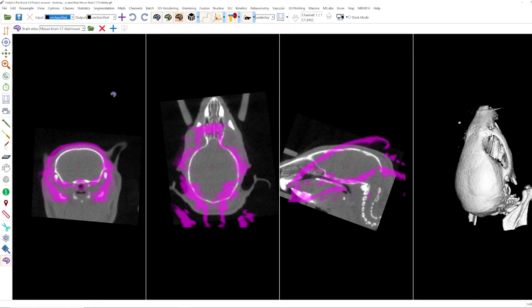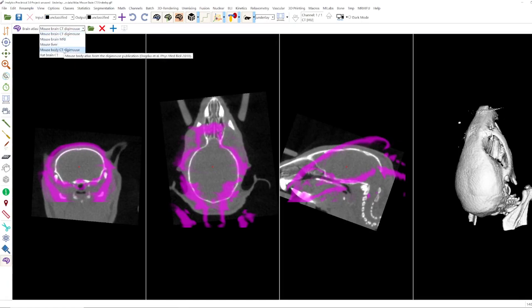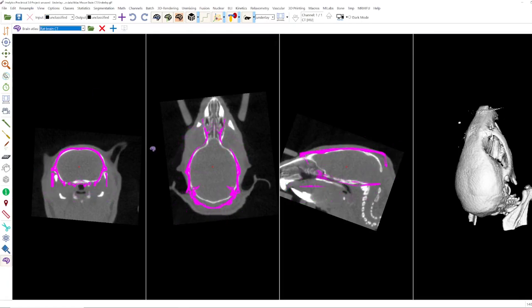Currently in the software we have the mouse brain CT Digimouse, mouse brain MRI, mouse liver, mouse body CT Digimouse and the rat brain CT implemented. But we are planning on implementing more atlases.